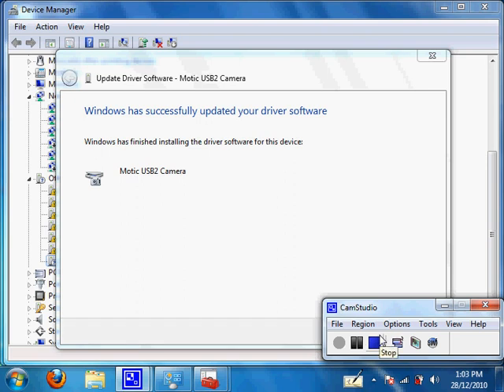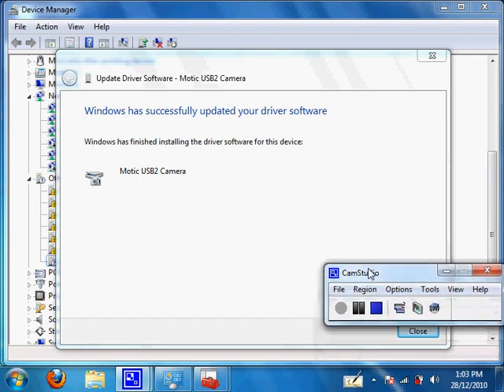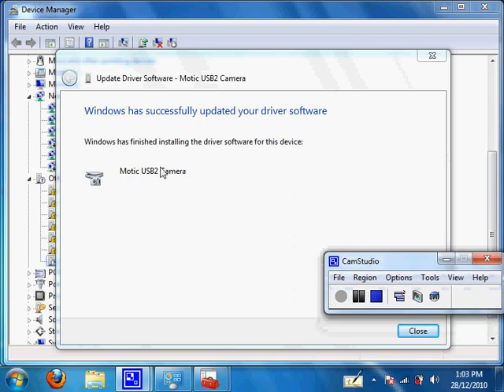Once the driver has done installing itself, you will get to this page. Windows has finished installing the driver software from this device. Motec USB 2.0 camera.